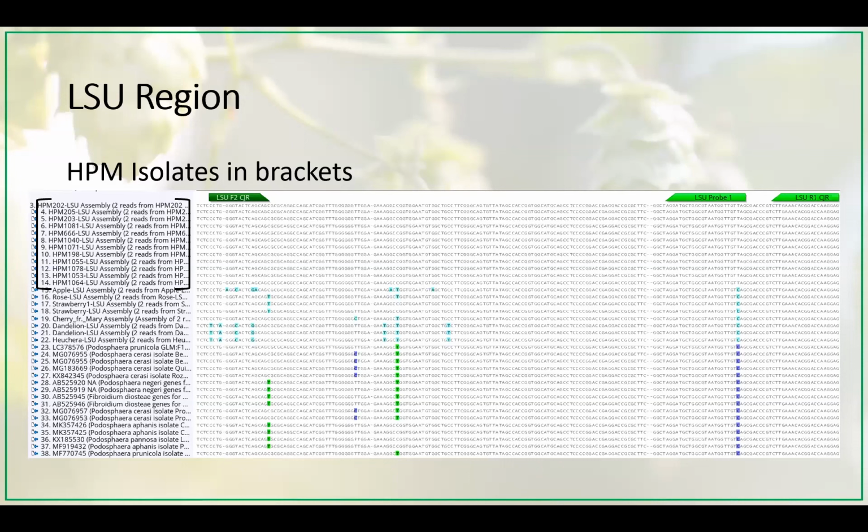I've also tried moving the probe into the center where there are some other SNPs, and hoping that if I move the reverse primer on that one conserved SNP, that might help confer some of the specificity.